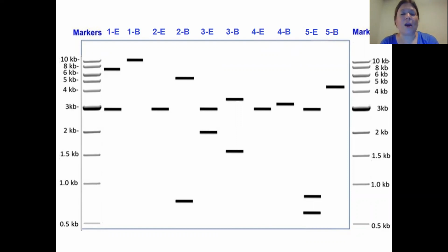Plasmid 5 is a little more complicated than that. That one has two distinct pieces of yeast DNA that both ligated together as well as ligating to pBluescript. But we were fortunate in that one in that the BamH1 lane just has a single band, and it's again the sum of the sizes in the EcoR1 lane. So those are the kinds of results that we hope to see. Even the more complicated one, like plasmid 5, is still reasonably straightforward.